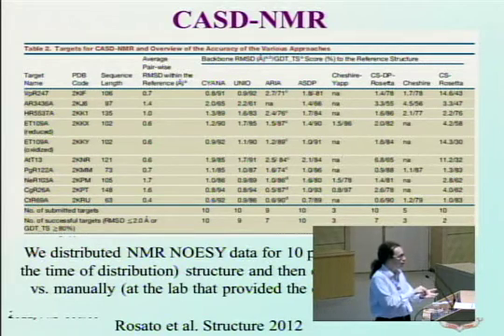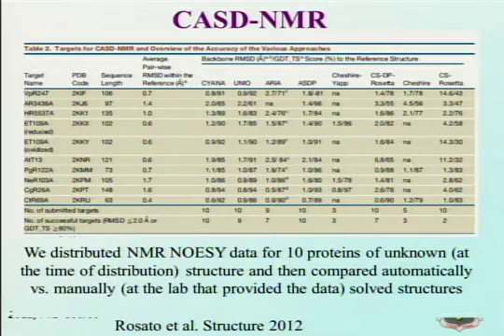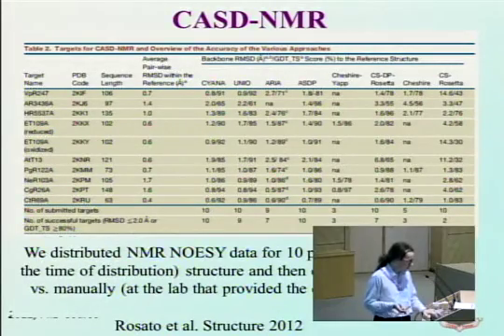So they identify the peaks, they assign them to the protons, they compute the structures, they correct errors if there are any, and they automatically produce a final structural model. Then we have, hidden somewhere, the true structure, and we make a comparison.